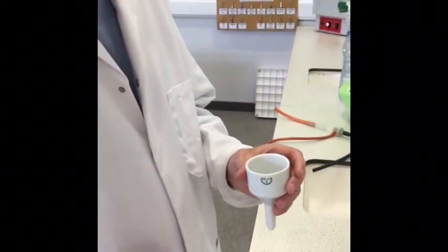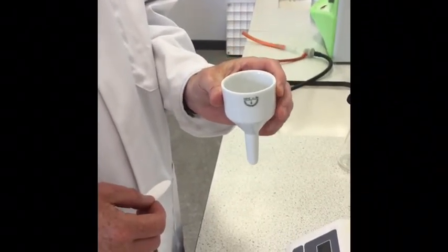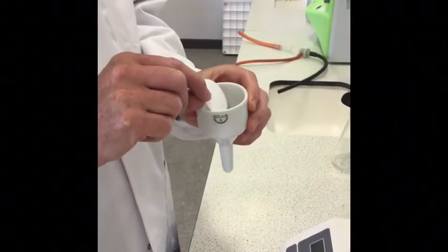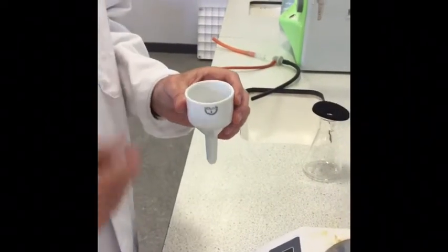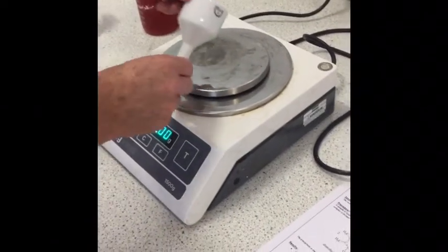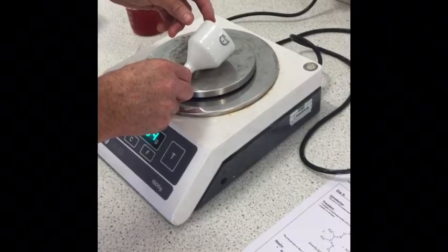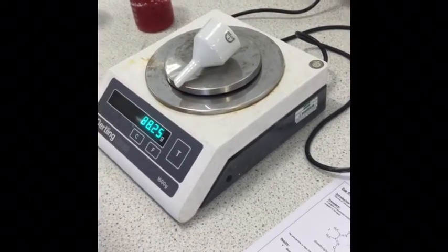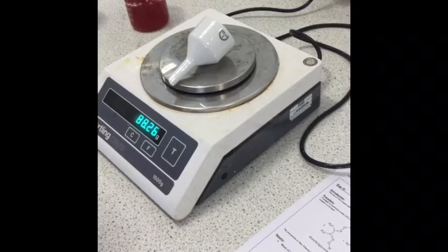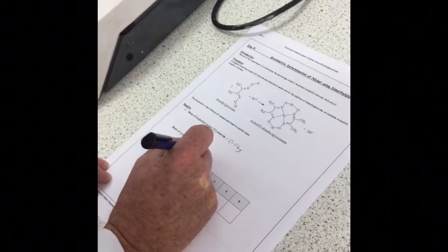Right, we're going to filter the precipitate using this thing which is called a Buchner funnel. So what we want to do is have the accurate mass of the Buchner funnel plus the filter paper before we filter it and after we filter it. So we tare the balance, put the Buchner funnel gently on. Need to be a wee bit careful to stop it rolling off. So that's 88.26. So record that on the sheet. The sheet says mass of crucible, it really should say mass of Buchner funnel. That's just a wee mistake.